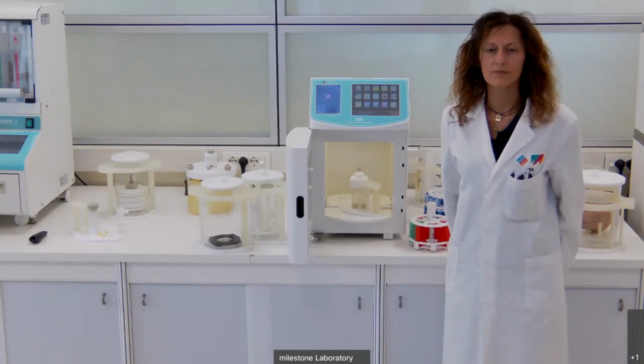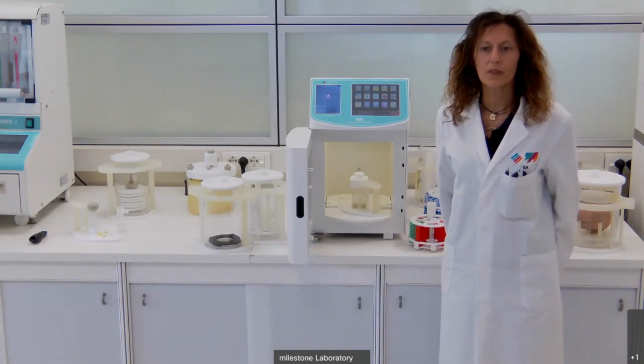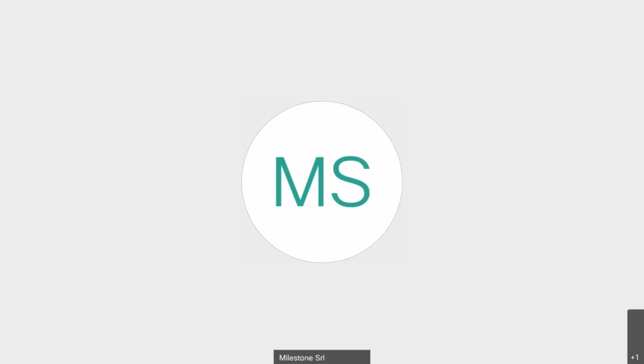Another question for you, Lisa, is this one, again about tissue processing. Is it possible to process samples with different thickness, like 1, 2, and 3 millimeters simultaneously in the same run? Yes, it's possible.